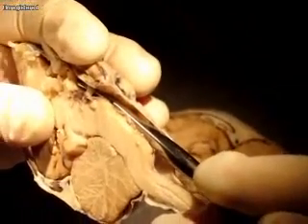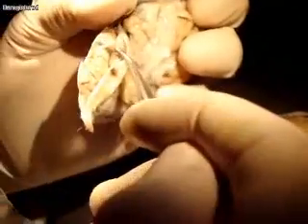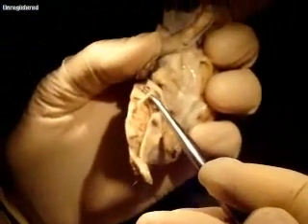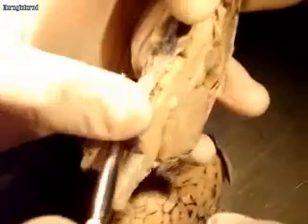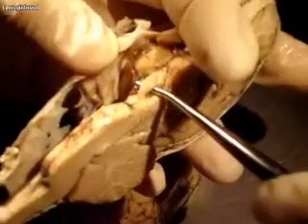O, to touch and feel, right? That's oculomotor. Some of you have the trochlear nerve. Here's the trochlear nerve right here. See it? That's the trochlear nerve. And I don't think this one has, some of you may have the vagus nerve down here at the bottom somewhere. This one doesn't have it. There's the trochlear one again, right here. And here's the oculomotor right here. See how big it is? That's oculomotor. And then trigeminal is this big one on the outside. This is all trigeminal.